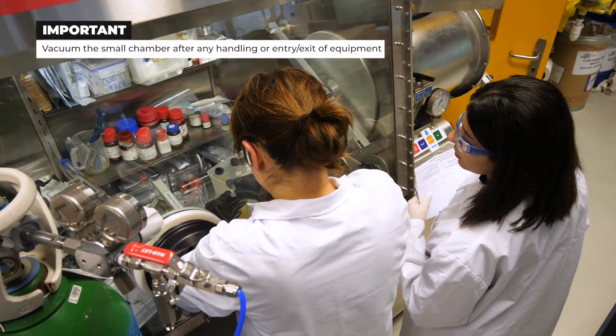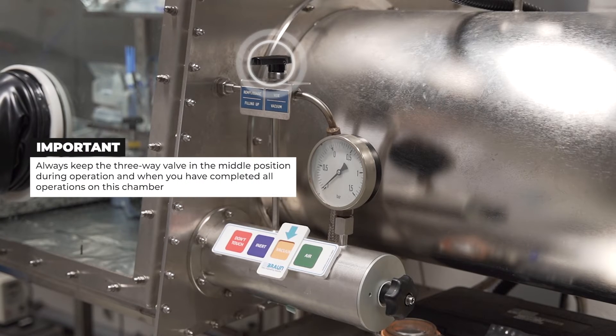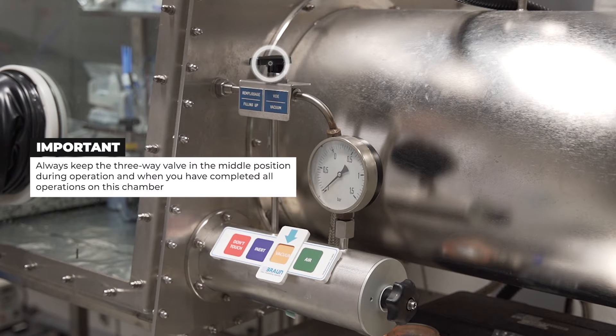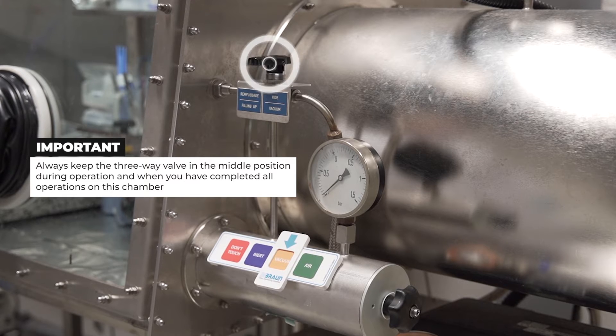Vacuum the small chamber after any handling or entry or exit of equipment. Always keep the three-way valve in the middle position perpendicular to the mini chamber during operation and when you have completed all operations on this chamber.